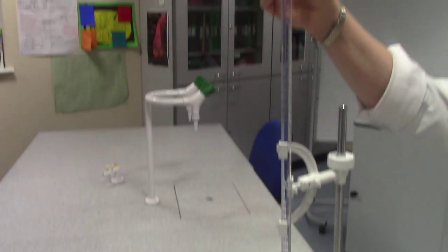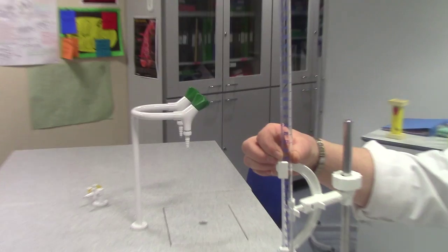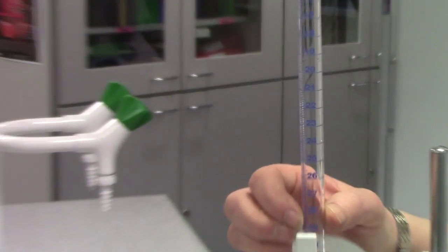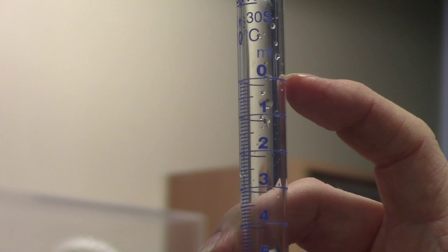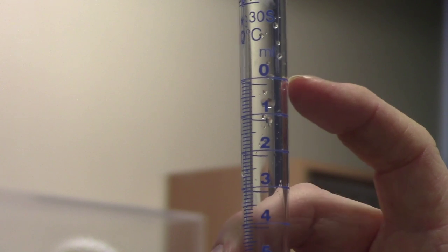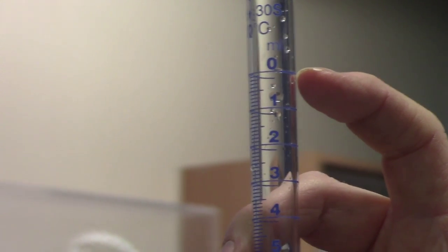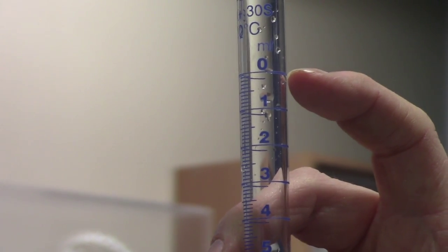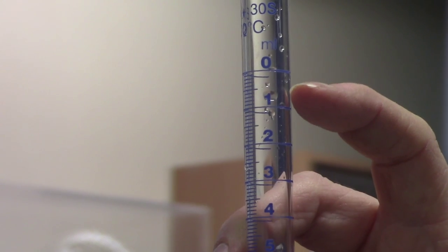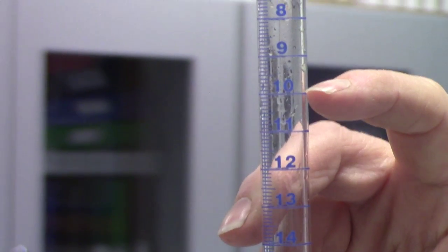The burette is a long cylinder and it's got a graduated scale which enables us to record the precise volumes we're using. It's an inverted scale, so it holds 50 centimetre cubed of solution, but the scale starts at zero. As solution is dispensed, it tells us how much solution has been dispensed into the analyte.